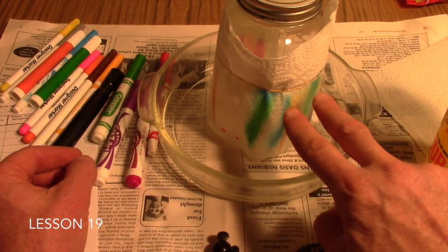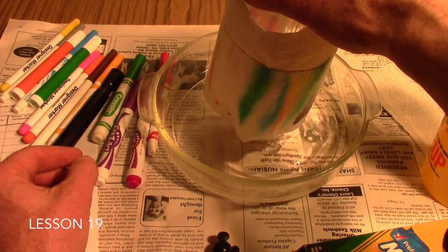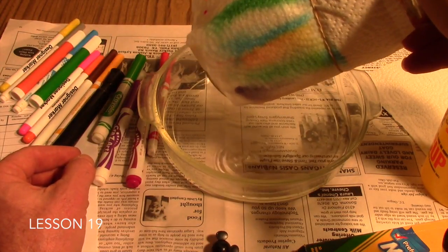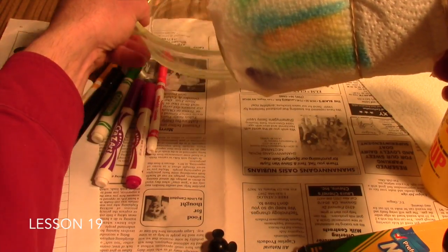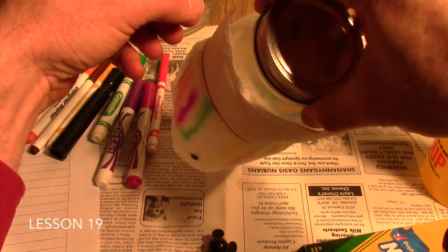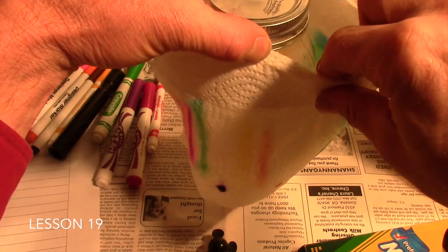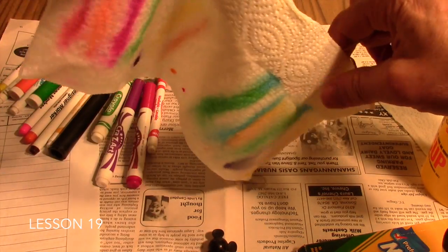When you feel like the front has traveled clear to the top, what you can do then is carefully remove your paper towel or coffee filter from your jar. And we're going to move the dish aside. And I'm going to carefully take it off here the best I can without wrinkling it too much. And what we want to do is lay it out flat for your students to observe then.